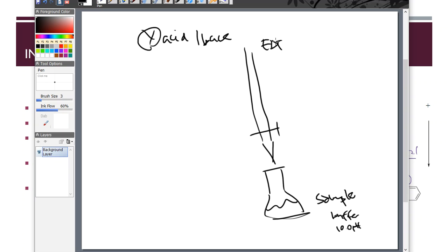The EDTA, ethylenediaminetetraacetic acid. Well, that's an acid that buffers a base. That's not what this is. Because this is an acid, but this has already lost protons. It's already negative. By the time it gets into this beaker, it's already negative, folks. So we are not relying on a reaction between an acid and a base. That is the misconception with water hardness titration.